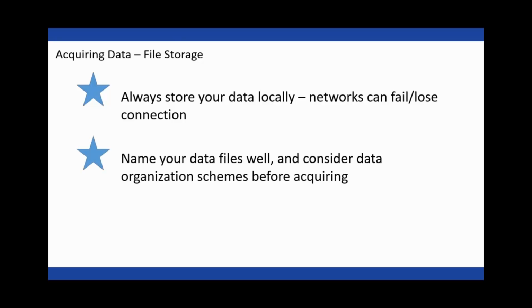You should also name your data files well, and you should consider your data organization schemes before you start acquiring data. If you do this afterwards, you could end up with a folder full of a lot of files that weren't named well, and it can be really difficult to determine what file is what when you go back months later for analysis. So a little bit of organization up front can go a long way.